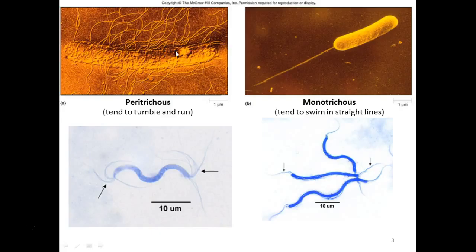But as you saw, that one that we looked at under the microscope, I'm pretty sure that one's Peritrichous. And again, it kind of tumbles around. The second one we looked at, I definitely know is Peritrichous. And for your organisms, once you figure out what your organism is, you can find this information on the internet: how many flagella it has and where they're arranged. So what's the shape of these two? Rods. So guess what? Yours is probably either mono or Peritrichous, for the ones that we have in this class.